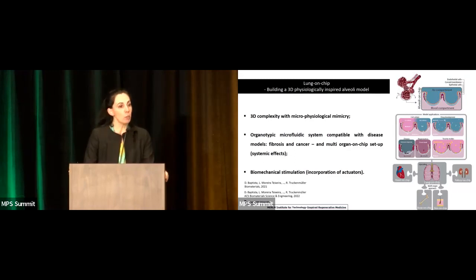And the reason for that was that we noticed that curvature plays a really important role in how the cells that are present in the native tissue mature and how they behave. So it's really important to take into account which cell sources we use, of course, but it's also equally important to steer them to mature properly and to have the diversity of phenotypes that we want to have at the end to again have a more effective model.